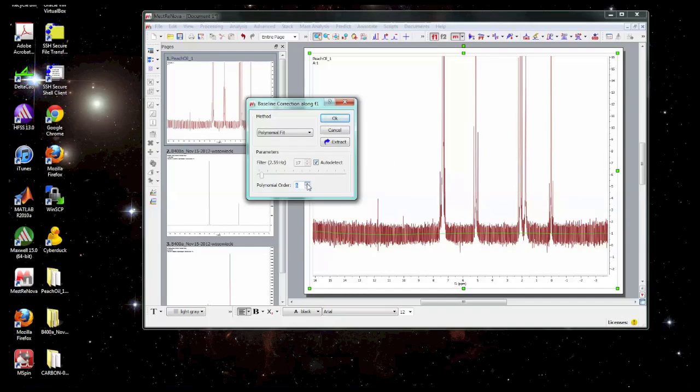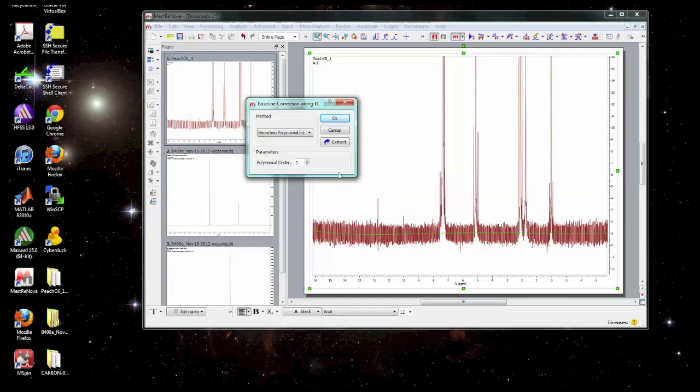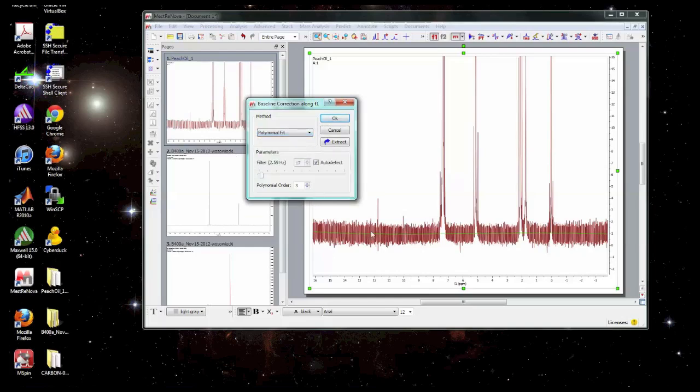Now you can change the order of the polynomial but just beware if you get too high order you can start to get some crazy oscillations and again start removing real information or actually make the data look worse rather than better. So normally a reasonable option is a fairly low order polynomial like a second or third order polynomial. For this one we'll use a third order polynomial and then we'll, I can cover one other thing. The Bernstein polynomial is another form of polynomial that's related to the Fourier transform. You can try it if you wish. Sometimes it works pretty well without any additional parameters.